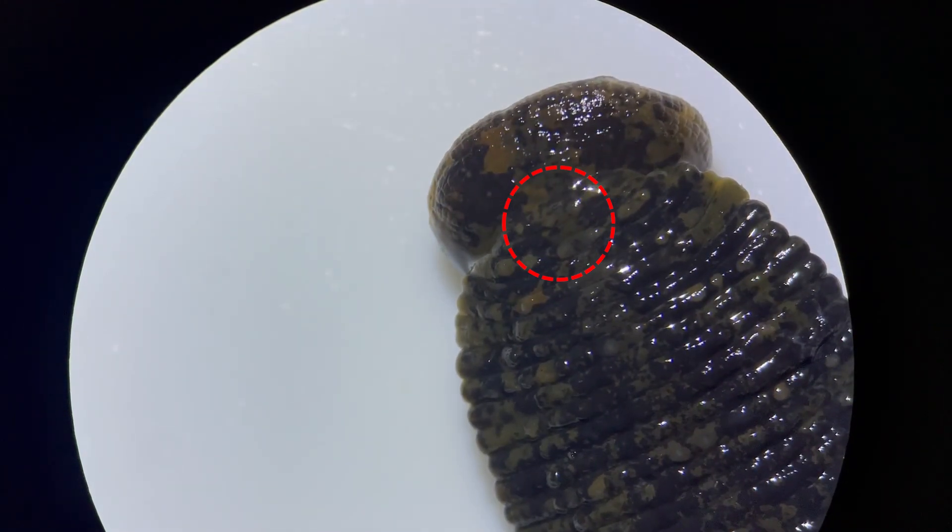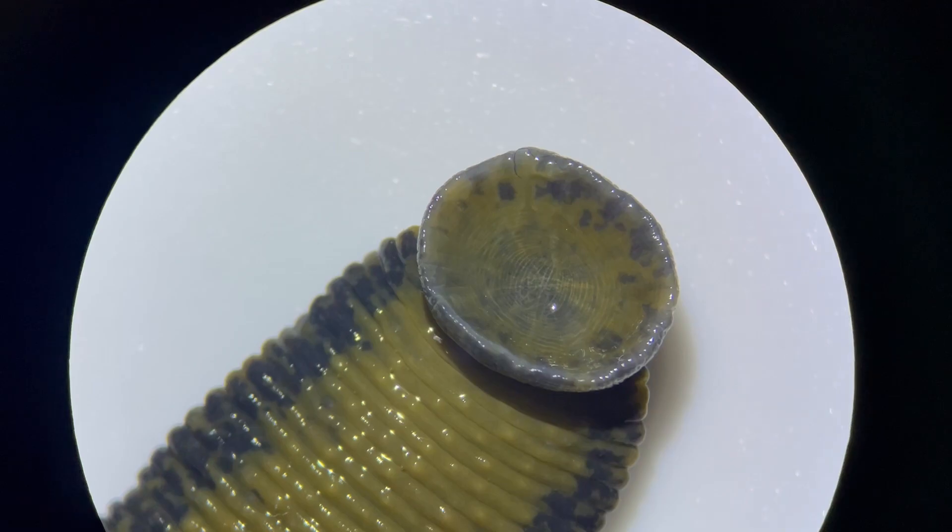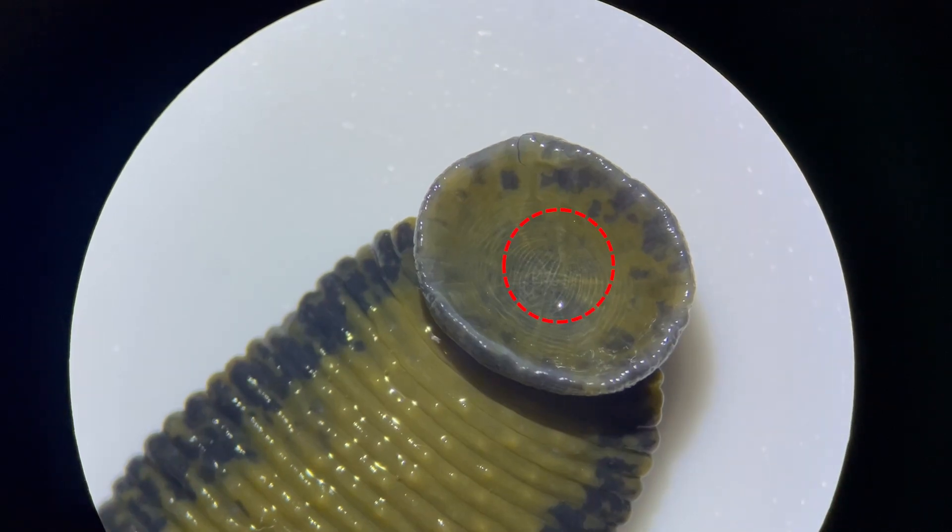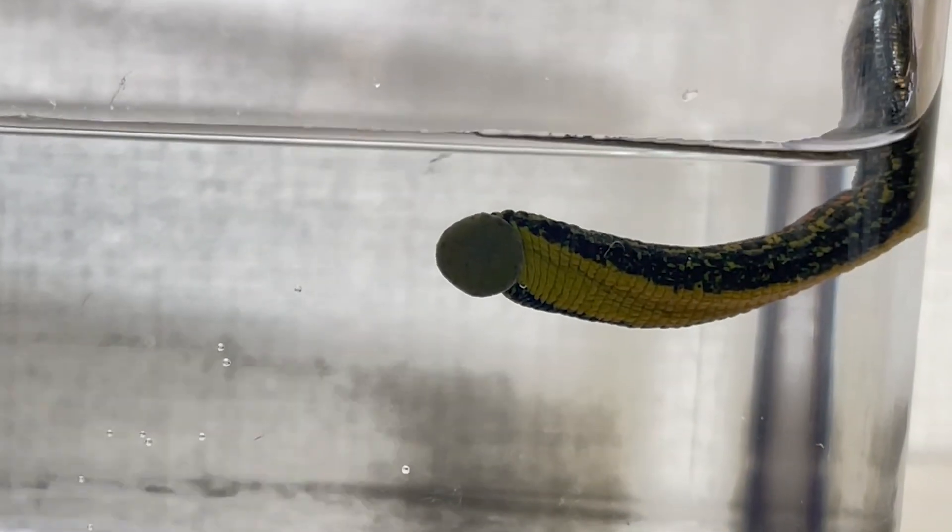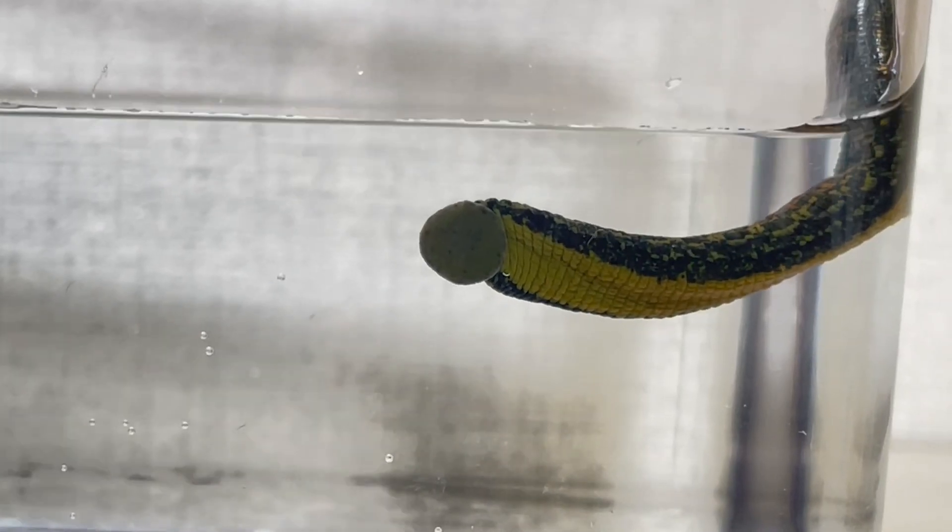The anus is located above the posterior sucker. Since the suckers are usually attached somewhere, the central area of the sucker is not an ideal location for excretion.